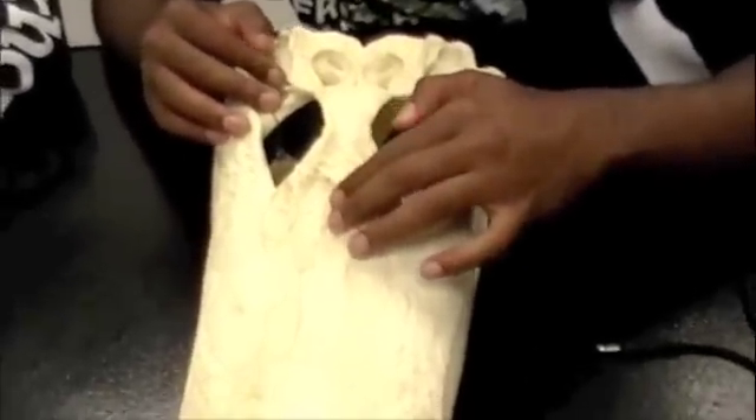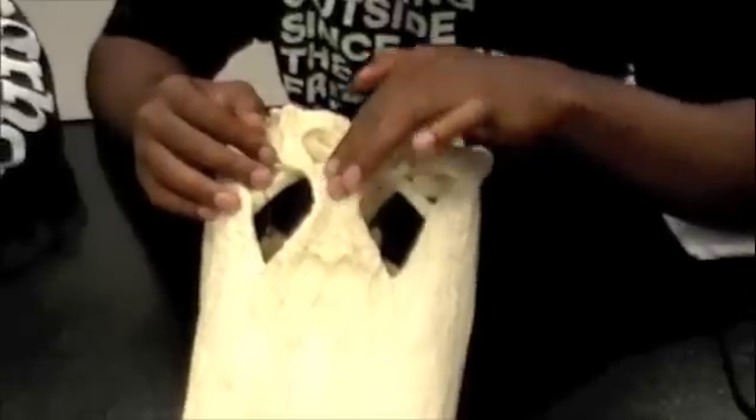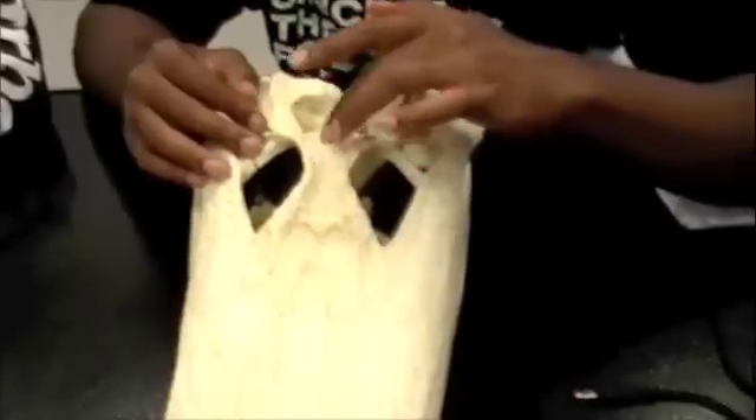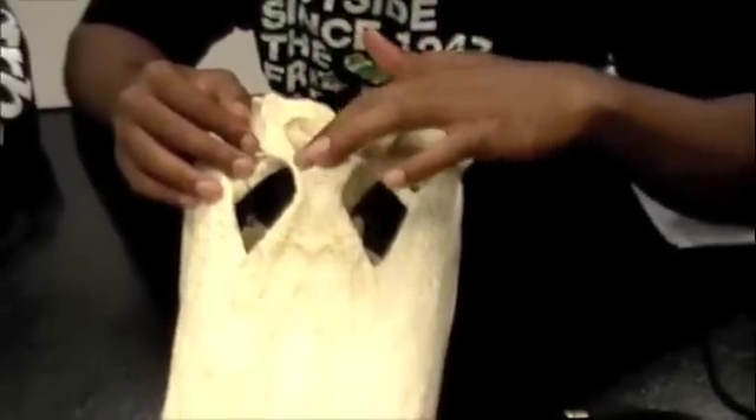Is this the frontal, then? No, it's behind the eyes. It's right here? That's right here, then? Yep. Frontal. Okay.